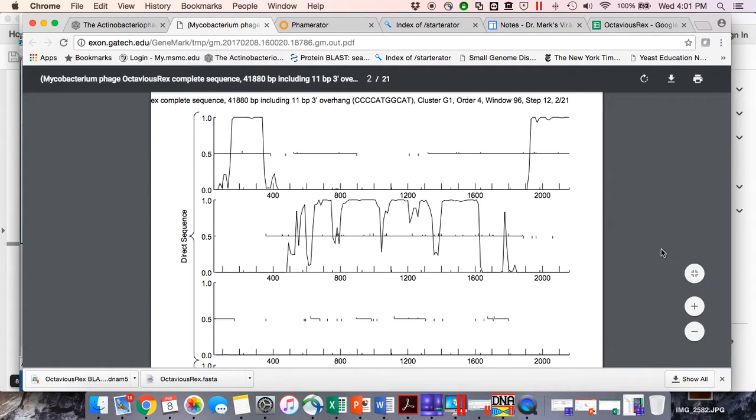We're going to look for a stop codon. So 1888 is going to, so this is 1900, so not there. Aha, there's our stop codon. So the question is, is there coding potential in this region? And anytime you see these peaks, the area under these peaks is coding potential. Because there's a lot of area under these peaks, in fact, there is coding potential here. So as long as you have peaks here, we would say, yes, there's coding potential.